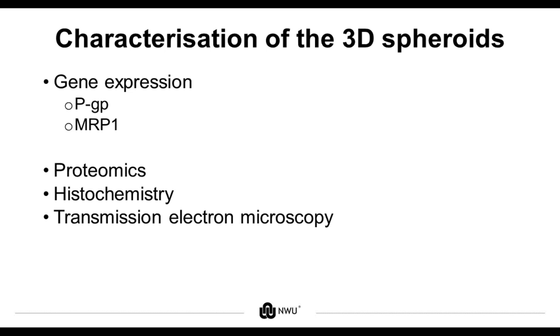Now, specifically for our 3 small cell lung cancer cell lines, it is necessary to confirm the efflux transporter expression of each. Therefore, gene expression analysis using specific primers is done to ensure that PGP and MRP1 are hyperexpressed in the particular line, as indicated by their supplier guidelines.